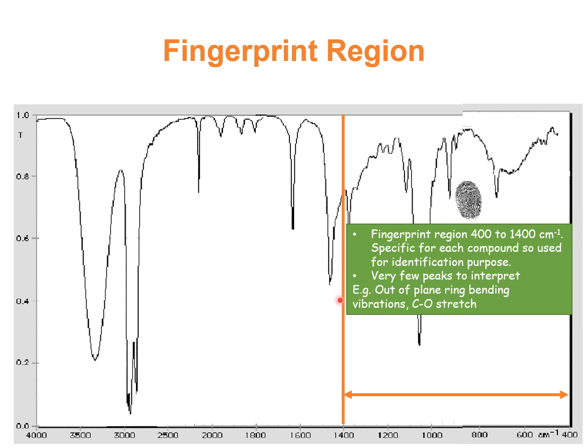Still, there are two important vibrations which come in this region. They are the C single bond O stretch and some vibrations which are observed in monosubstituted and disubstituted benzenes. We can even distinguish between them. Only these two vibrations are of importance with respect to structural elucidation.